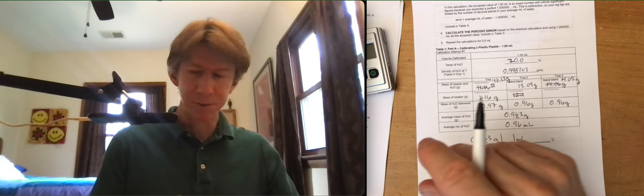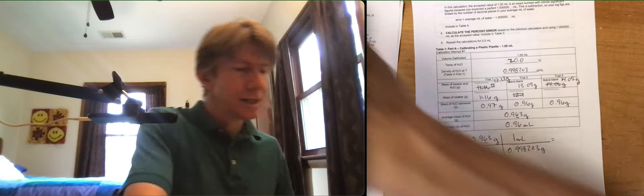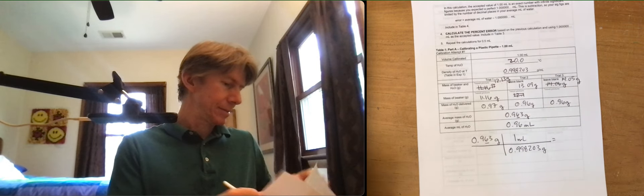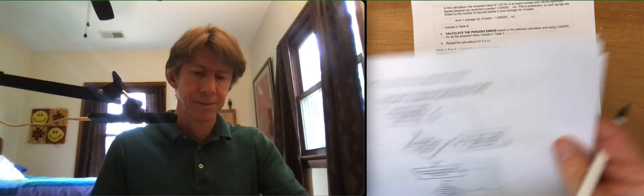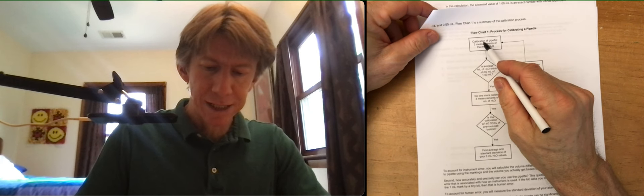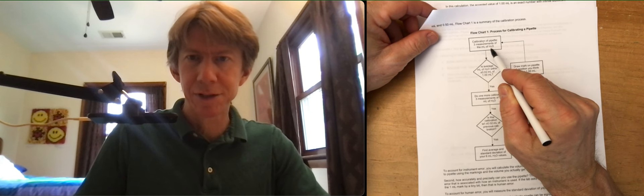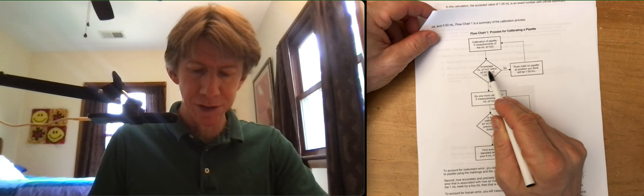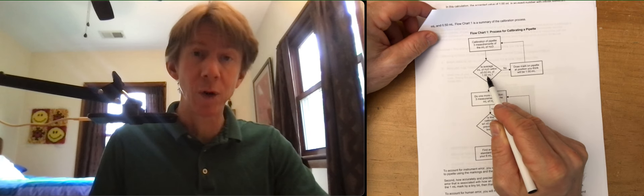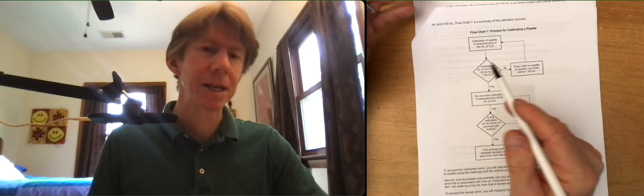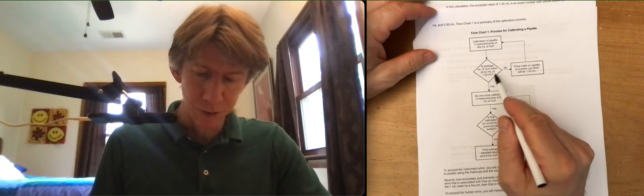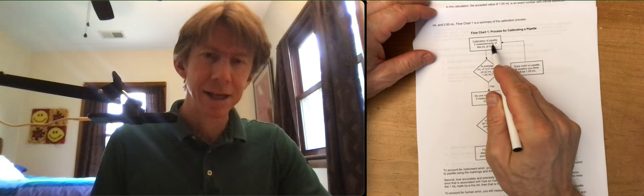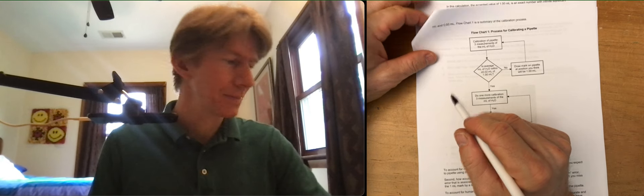That is coming back to our flow chart. I have done calibration of pipette. Three measurements of the milliliters of H2O. Is the average milliliters of H2O within plus or minus 0.02 milliliters of 1.00? No. Nope. Draw a mark on pipette at position you think will be 1.00 milliliters. And do it again.